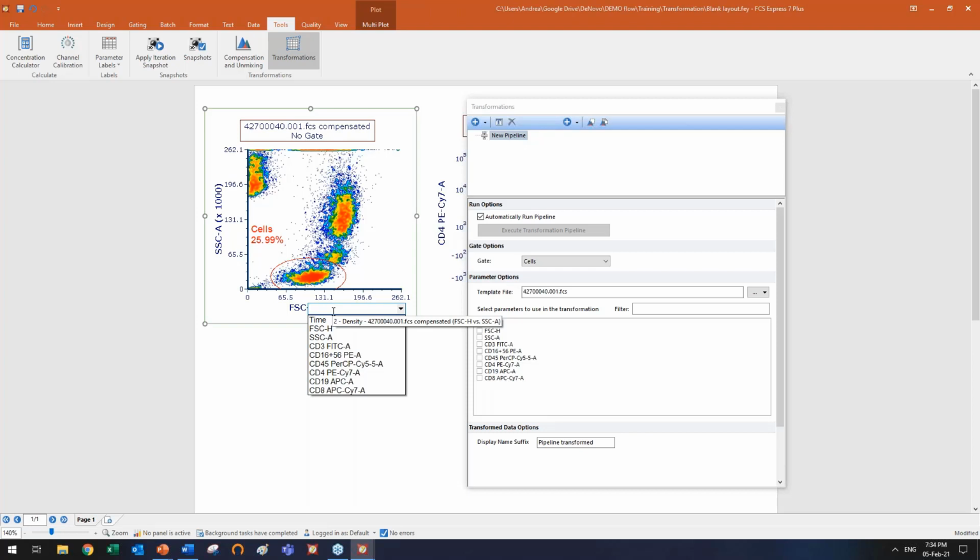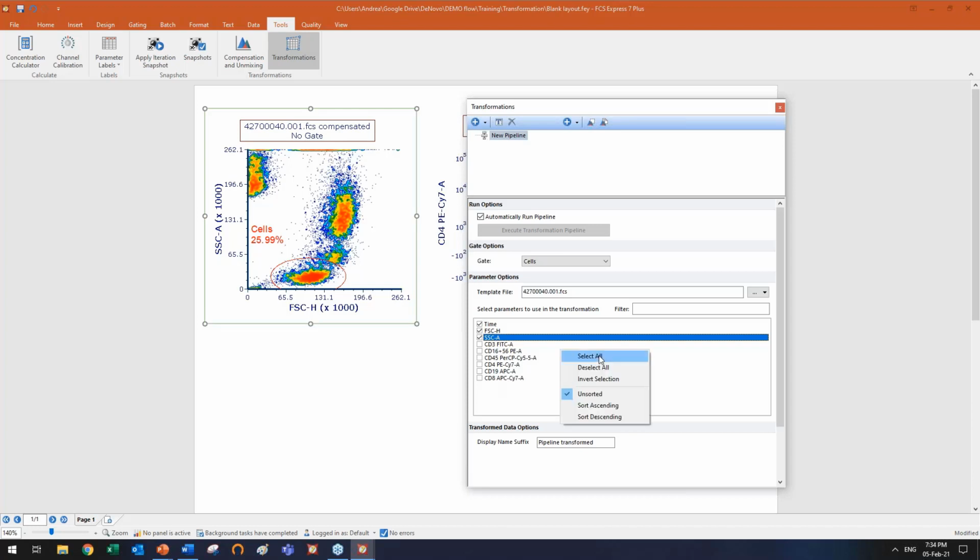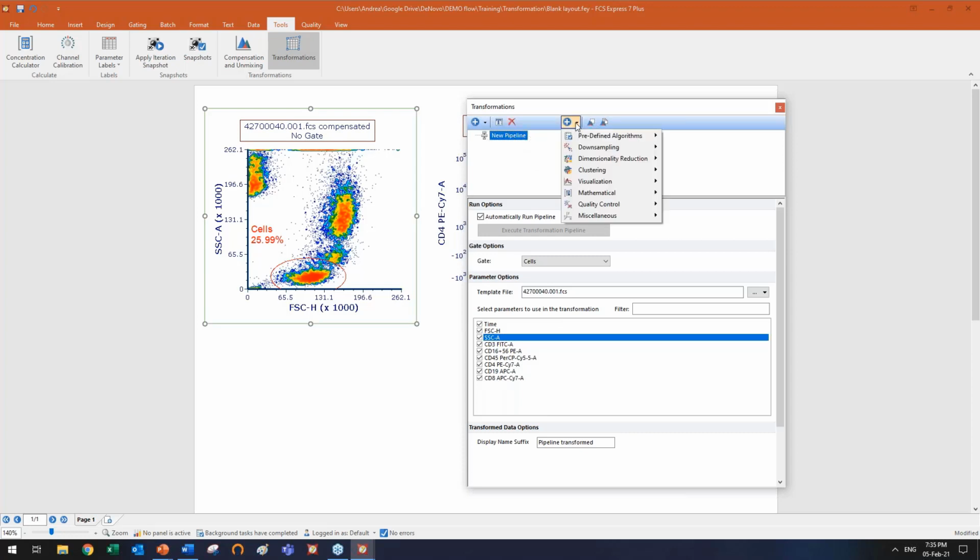Okay, nothing to be scared of. Now, you can click those parameters one by one. Again, I usually suggest to right-click and select all. Those will be the input parameters in my pipeline. Now that we have created this main pipeline body, I can go here.